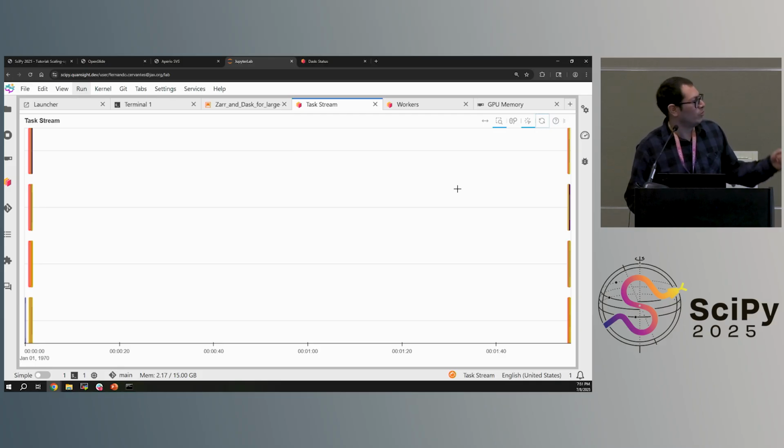So the next part is going to be importing the libraries that we need. We're going to be using Zarr, Dask Array, Matplotlib, scikit-image. And we're going to be using the image from the Zarr, the one that we have stored in the cloud. If you're running that locally, you can either download it, but you can use it even if you're running locally, because it is anyway accessing that through the internet.